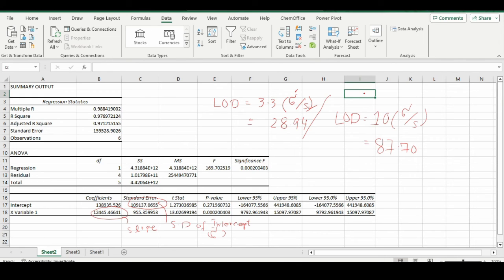In this way, the minimum level of analyte or concentration that can be quantified using that ICP-MS instrument is 87.70.